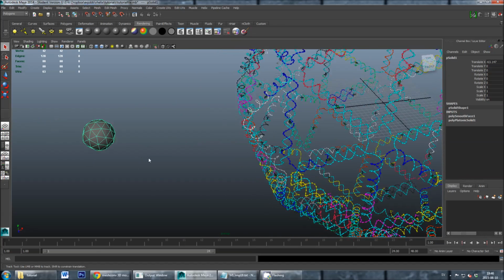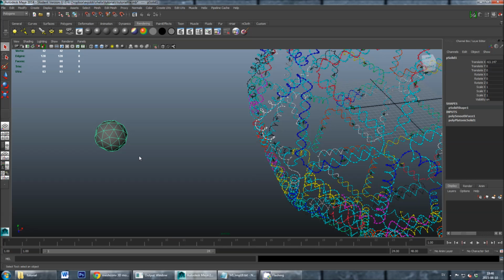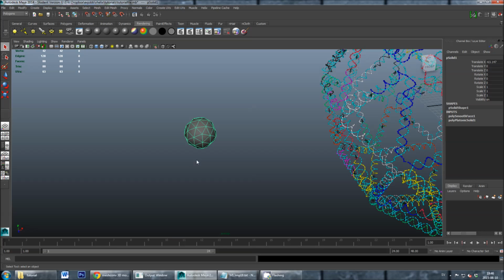So this process has three main steps. The first step is to create the mesh in a computer graphics software. This mesh is then exported and run through our scaffold routing software, where a scaffold routing is found through the mesh. In the third step, this routed scaffold is exported back into vHelix, in our plugin to Maya, where the final scaffold and staple design is produced and a sequence is assigned and exported for all the staples.